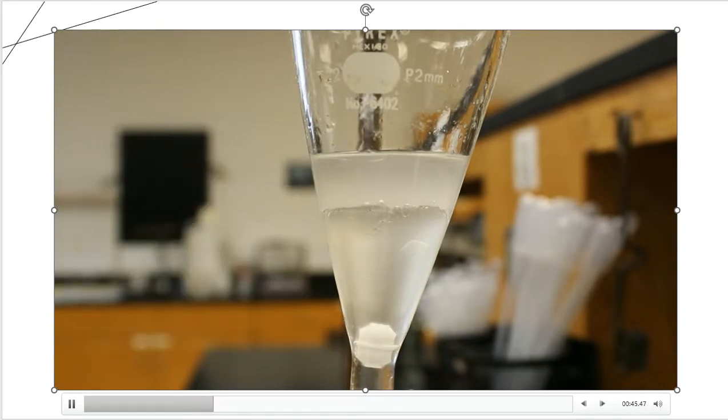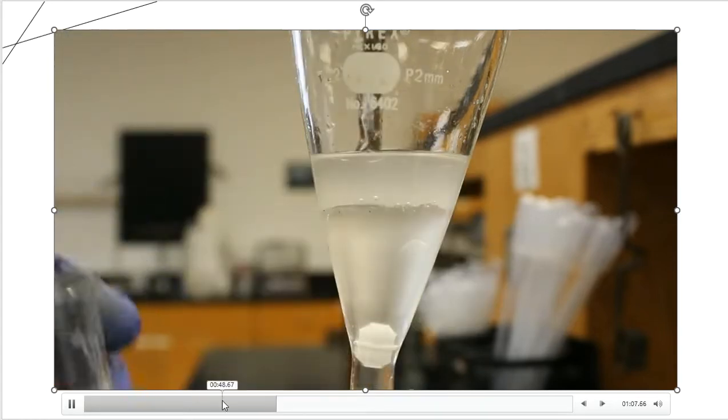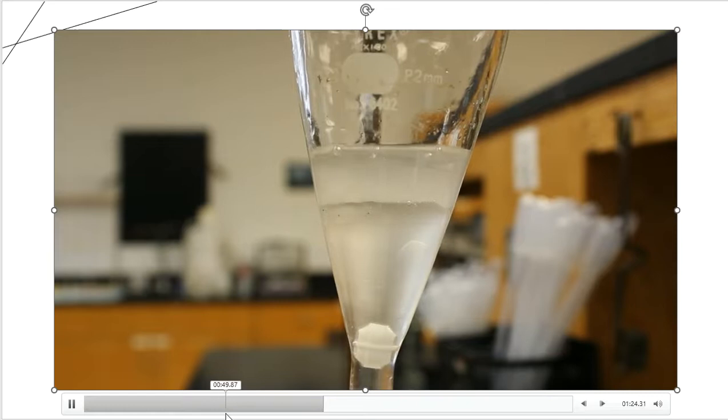Now the issue is, well, which one is which? How do I know which is aqueous and which is the methylene chloride? Well, the answer here is density. Density is going to tell you which one is which, because the density for water is 1, and the density of methylene chloride I might have to look up. Or, if I don't want to take the time to look up, the nice trick in a laboratory: look, I've got this flask or this beaker that I had my product in. I'm going to use a little bit more methylene chloride to transfer that over so I don't lose anything, or help prevent loss. And I'm just going to keep an eye on which layer gets bigger, because whichever layer gets bigger, that is the methylene chloride layer. So keep an eye on which layer is going to increase.